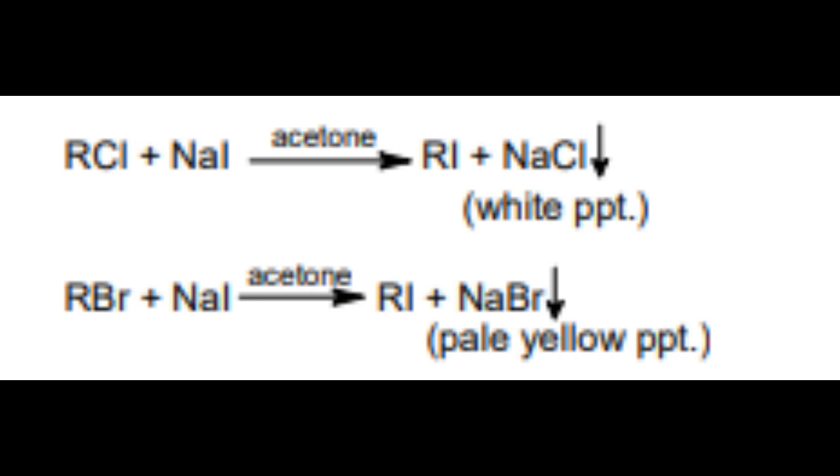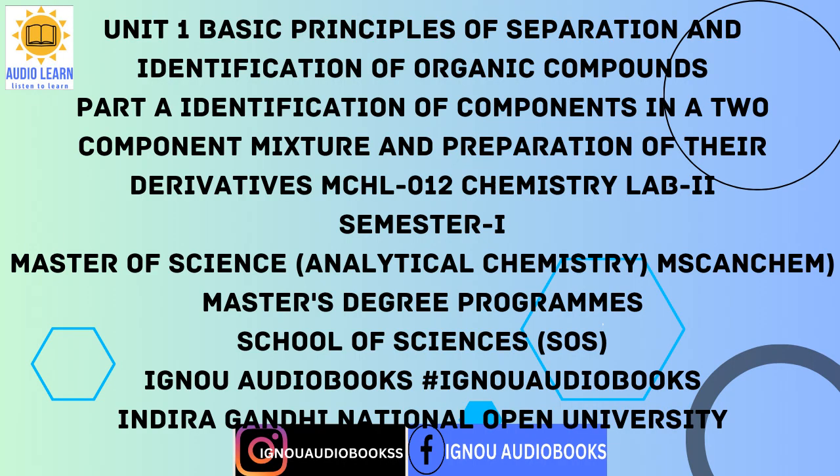Usually, the following derivatives, as given in Table 1.3, are prepared for the various classes of the compounds as identified in Step 5 above. Appendix I, data tables of organic compounds and their derivatives. Table 1.3, derivatives usually prepared for different classes of organic compounds.